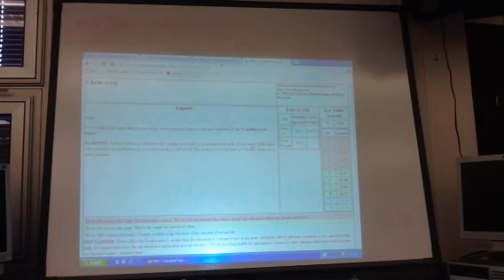That's about it. One other thing I want to draw your attention to. On the back, this theoretical yield of soap, you're going to have to recalculate that because now you have a new mass of fat. Your mass of fat is now 98.5 grams of olive oil, so you're going to have to redo your calculations. On the very back page where it says theoretical yield of soap, of your bar of soap, you'll have to do some recalculation, but that can wait.